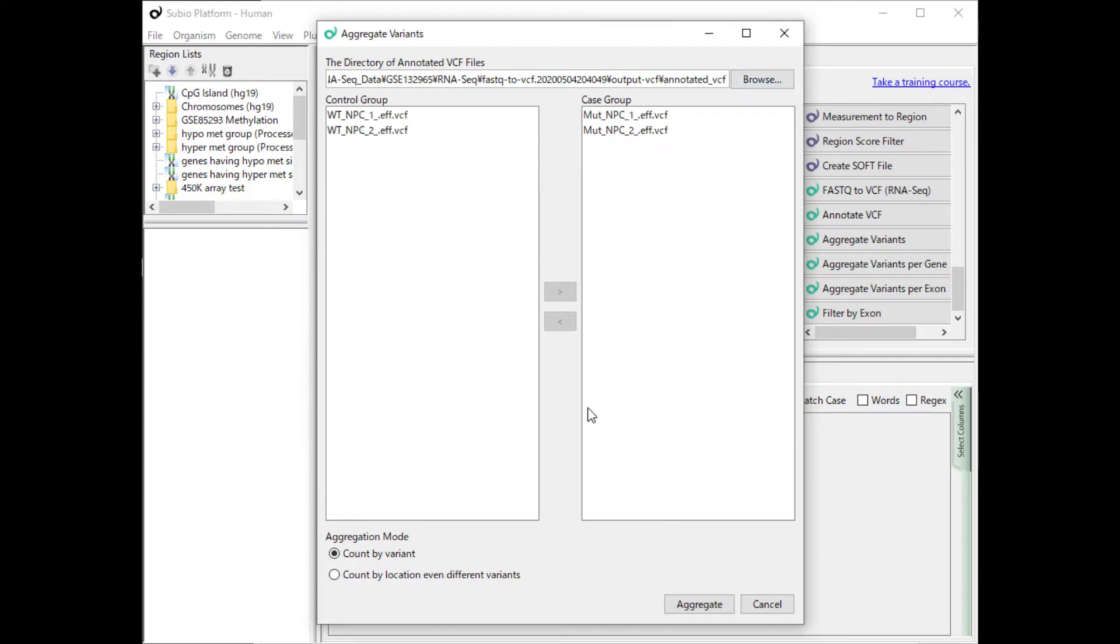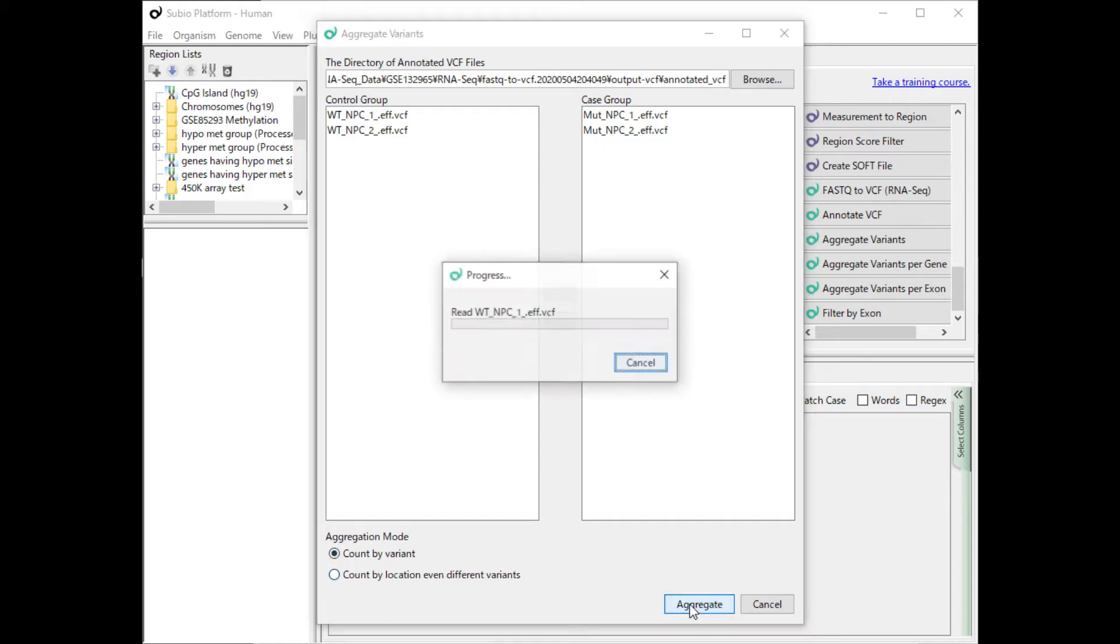Move the WT to the control group, select the Count by Variant mode or the Count by Location mode, and press the Aggregate button.